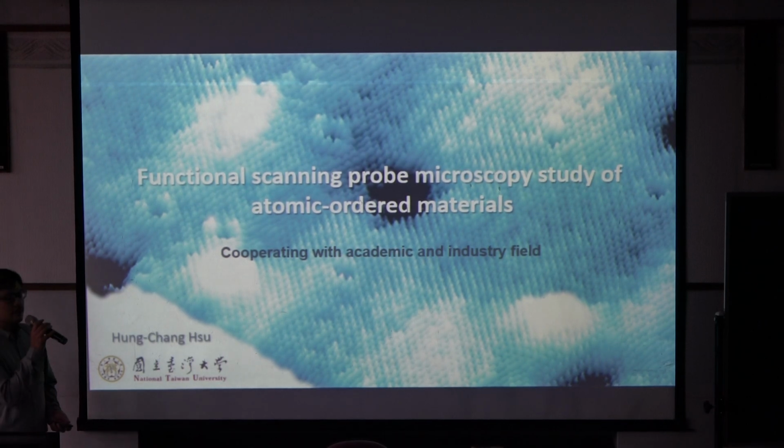Okay, good afternoon, everyone. I am Hongzhang Xu, and now I work at National Taiwan University and do postdoc research with Professor Yafeng. The topic I want to share today is the functional scanning microscopy study of atomic ordered materials. Benefiting from the atomic resolution of scanning probe microscopy, it allows us to easily cooperate with academic and industry fields focused on material science improvements.